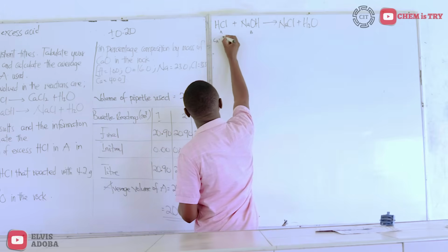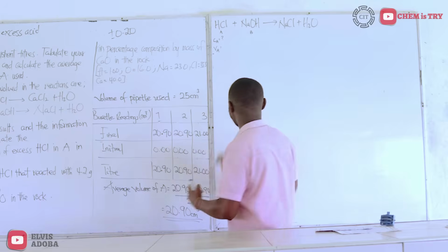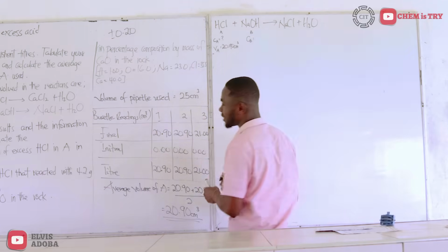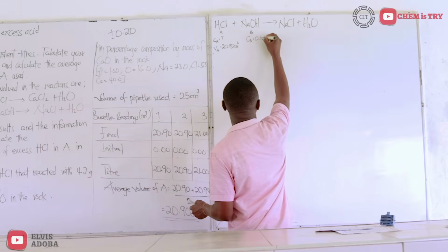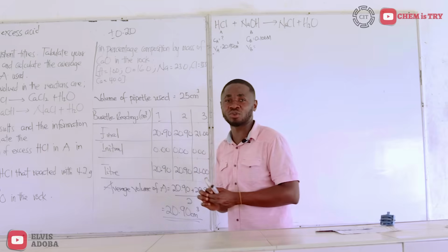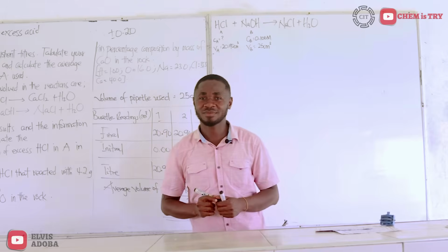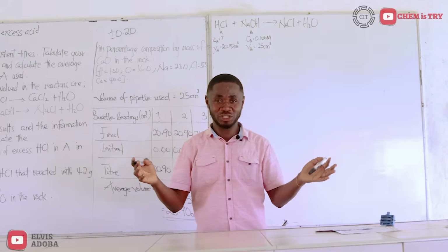We don't know the concentration of solution A, but we have its volume as our average titer, 20.90 centimeters cubed. For solution B, it's a standard solution, so we have its concentration already in the question, and that is 0.100 molar or mole per decimeter cube. And its volume that was used for the titration is the volume of the pipette. We pipetted 25 centimeters cube.